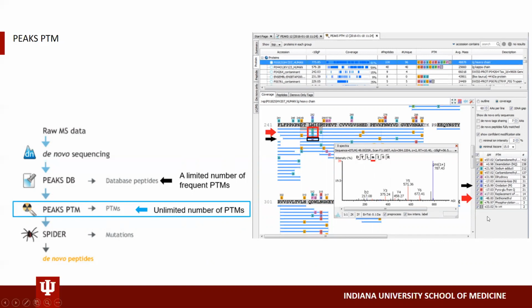All sorts of different modifications were found on this protein at this specific location. You can see that this is pretty confidently identified because there's multiple PSMs, and it absolutely would not have been seen in a normal database search because you wouldn't bother looking for it. So it's kind of nice that you can find some new patterns perhaps in your samples.